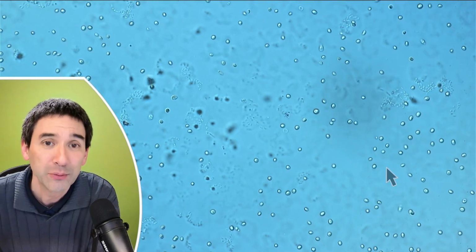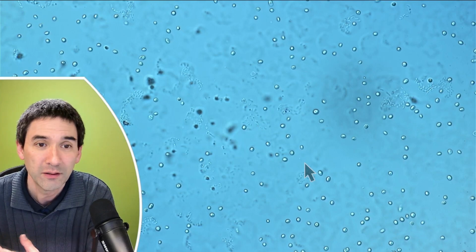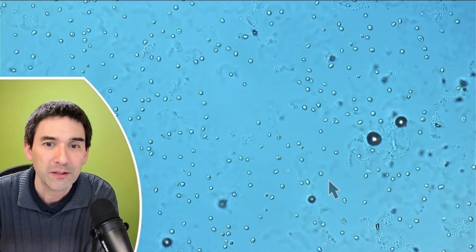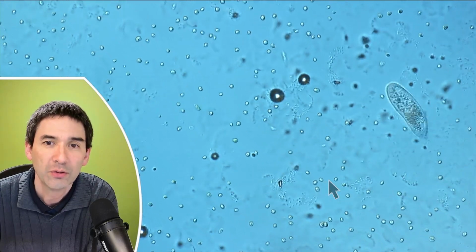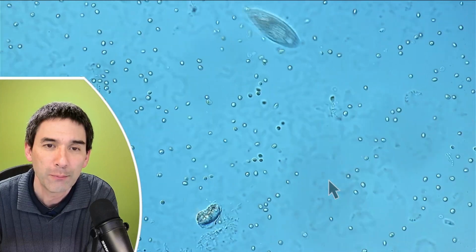And here you can see again over here, this is clearly a directional movement, because I suppose the water is evaporating from the edge of the cover glass, and therefore it's kind of streaming into one direction. Or it could be that there is simply more, now it stopped, and this happens quite frequently somewhere where an air bubble pops or fuses together, or it can be several possibilities. By the way, in case you're wondering, changes can also happen because when algae produce oxygen by photosynthesis, that's clearly directional movement here. When algae produce oxygen, then bubbles can appear, and they can also push the particles around, right?